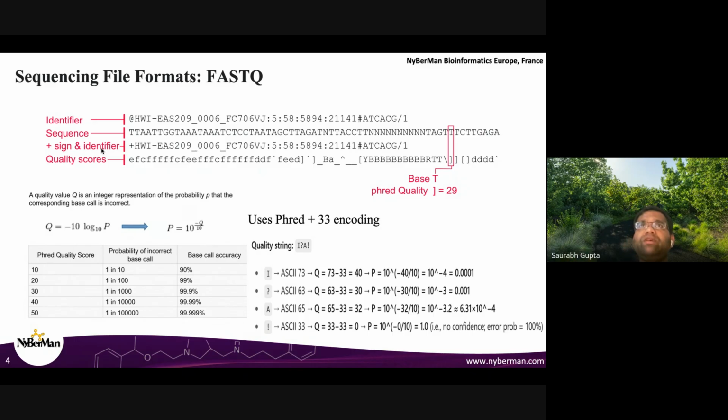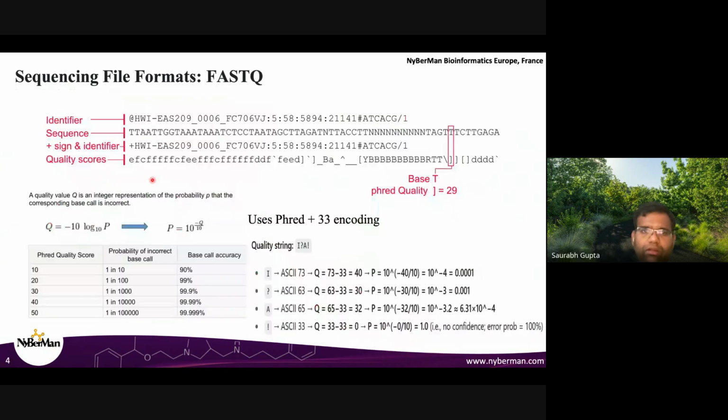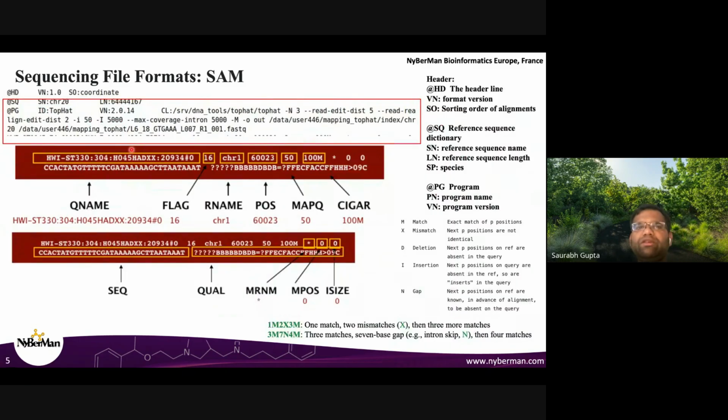Now you see this red, the laser pointer red is same as this one. So now you see this red, the laser pointer red, and this red is different. Now both these colors can come from the same nucleotide added. That is, a T produces red anyway. But what kind of red it produces can vary, because of various factors, in intensity.